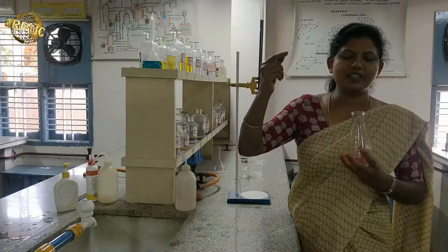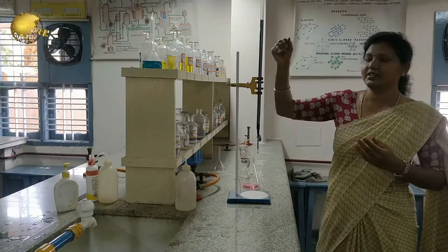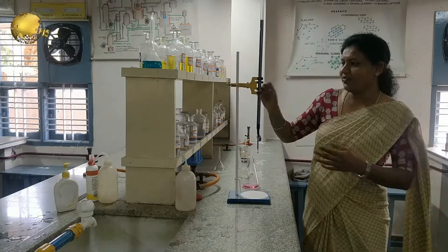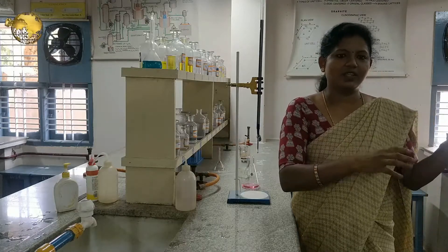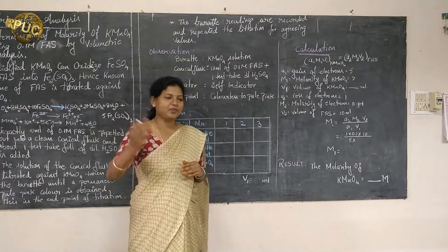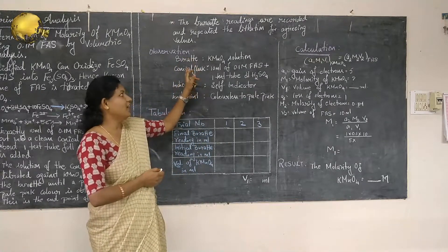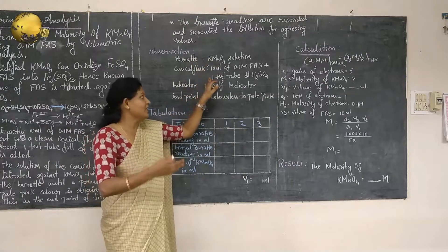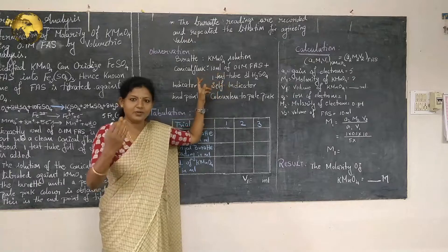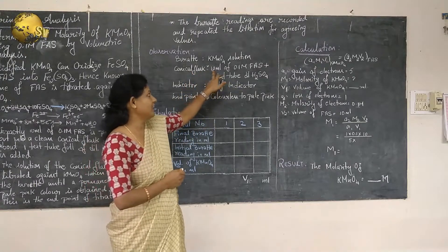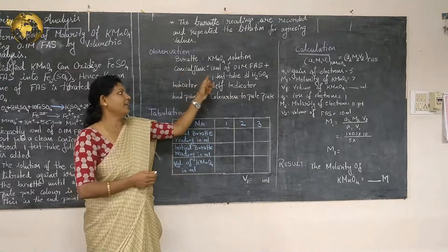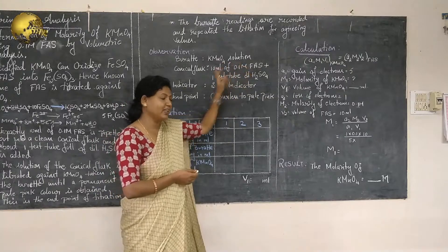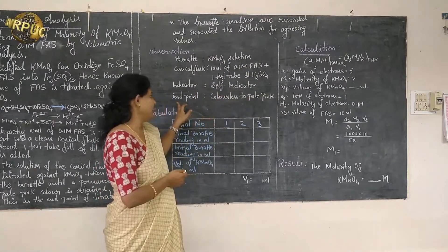What we had at the beginning is the initial reading; what we got here, 9.4 ml, is the final burette reading. We repeat this titration until concordant values are obtained, then tabulate the values. The solution whose concentration we have to find is taken in the burette, and the known concentration solution is pipetted into the conical flask. The ferrous ammonium sulphate, 10 ml of 0.1 molar, was taken. Because of the colored potassium permanganate solution, it acts as a self-indicator, and the colorless solution turns the permanent pale pink color at the endpoint.